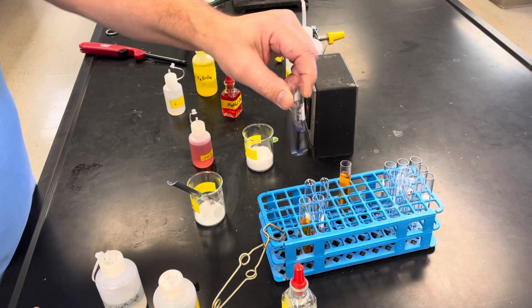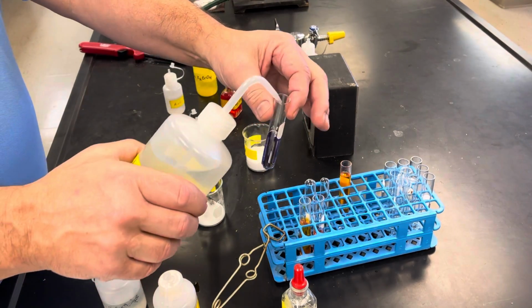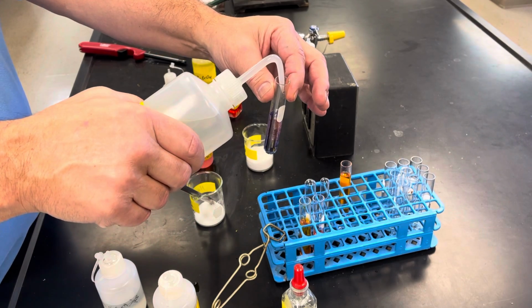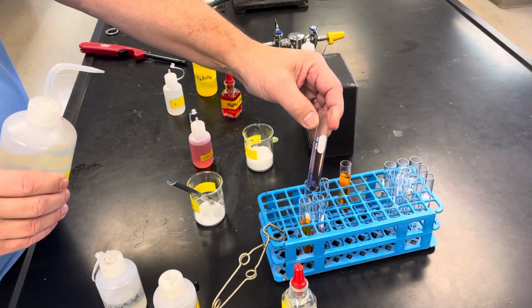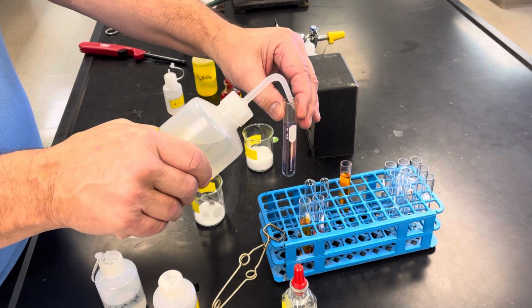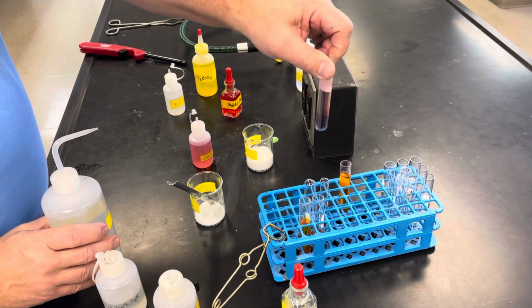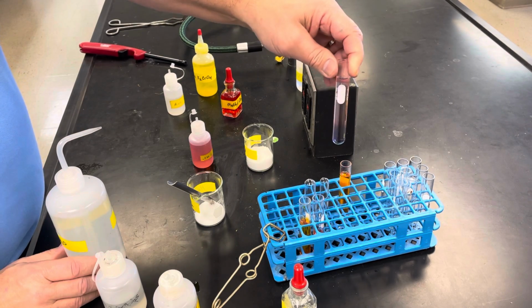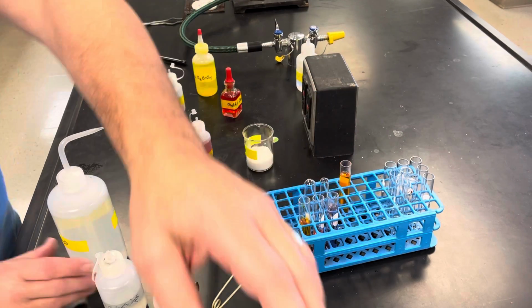Okay. Now the next part says to add some water to it. So when I add water to this, it actually makes it go back pink. Okay. If I add enough, it'll all turn into the pink color again. Now it's a diluted pink because I added so much more water, but it's going back pink.